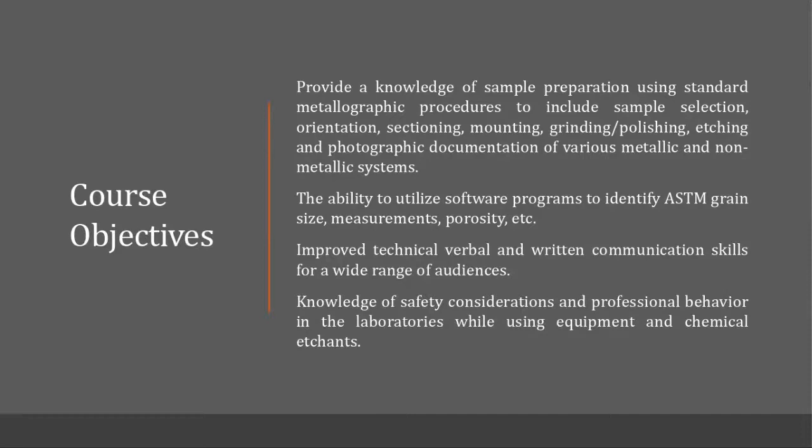And then porosity comes in handy. There are some instances where a certain amount of porosity is allowable for certain castings, aluminum castings, for instance. But it can be detrimental if you have too much porosity within a sample. So you're able to do any type of software analysis using those programs.